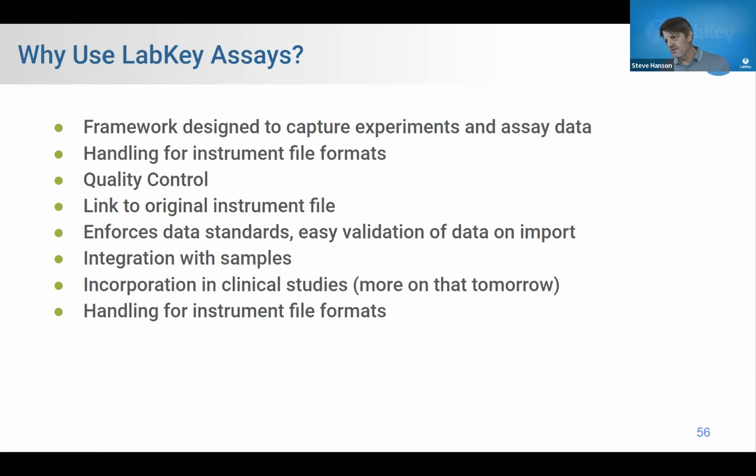Anyways, I see some questions here. Is there anything? It's a few questions on auditing. Let me just handle these. One question is, the auditing is awesome. Being so extensive, does that slow the server down, especially when you have hundreds of users?